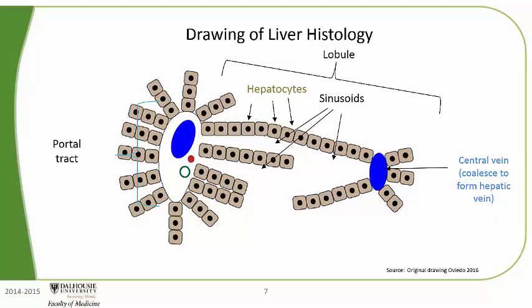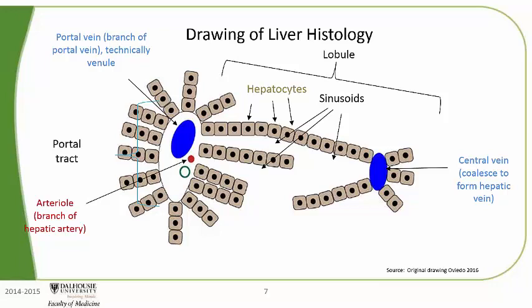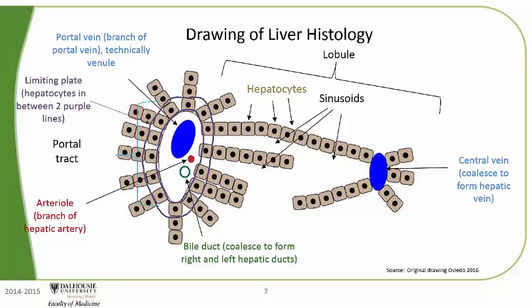The portal tract is a connective tissue region that contains the portal vein, arteriole, and bile duct. The portal vein is technically a venule, but most people refer to it as the portal vein. This portal vein is a tiny branch of the large portal vein that we saw entering the liver. The arteriole is a tiny branch of the hepatic artery. This bile duct is an intrahepatic bile duct, the same thing as a small bile duct. The small bile ducts coalesce to form the right and left hepatic ducts. The hepatocytes which surround the portal tract get a special name: the limiting plate.